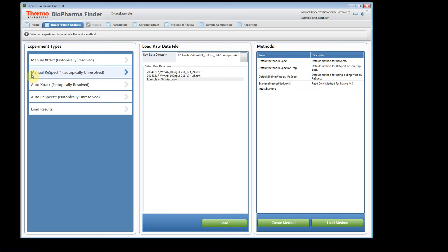For example, if you have a single file and then process the same sample two or three days later, you could use Manual ReSpect to create a method with all the parameters you want, save that method, and then use Auto ReSpect later to process your other data set. It's a more high-throughput way of processing your experiments.